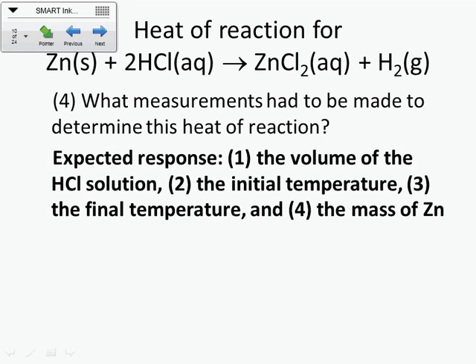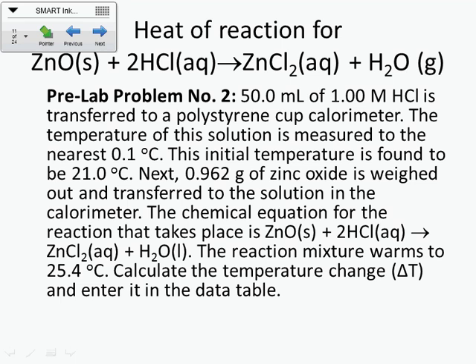You could do it, but ultimately, I think on this one, the molarity doesn't matter that much. As long as it completely reacts, you just need it strong enough that you have enough moles of H plus in there that it will completely react with your zinc. Which is kind of nice. Sometimes it's nice when you don't have to be really precise about at least one of your measurements.